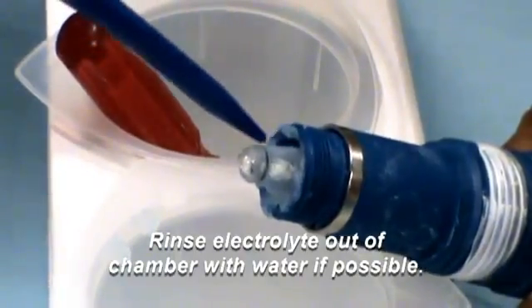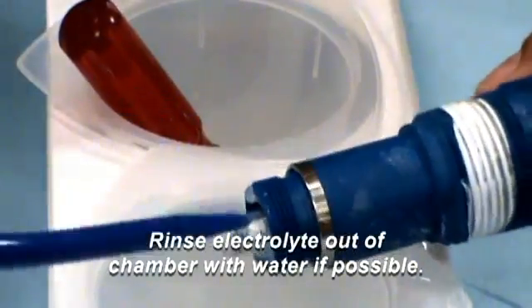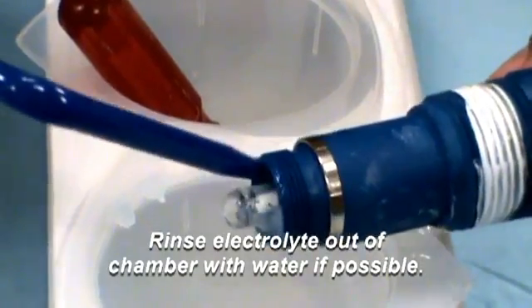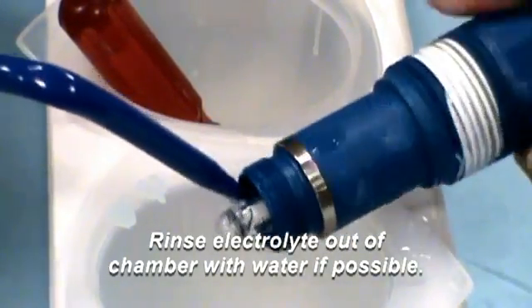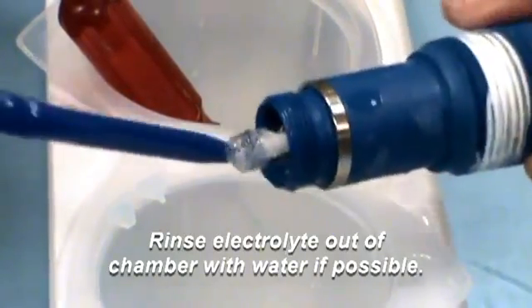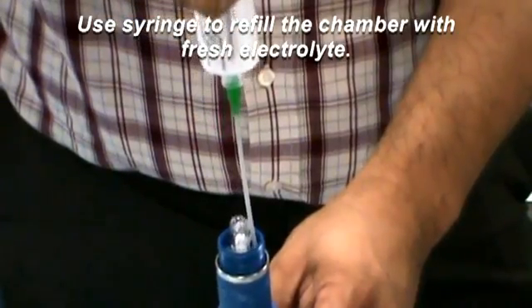If possible, rinse any remaining electrolyte out of the chamber, making sure to remove all or most of the electrolyte. You might want to swirl it around in the rinse water beaker, use a squirt bottle, or a nearby sink.